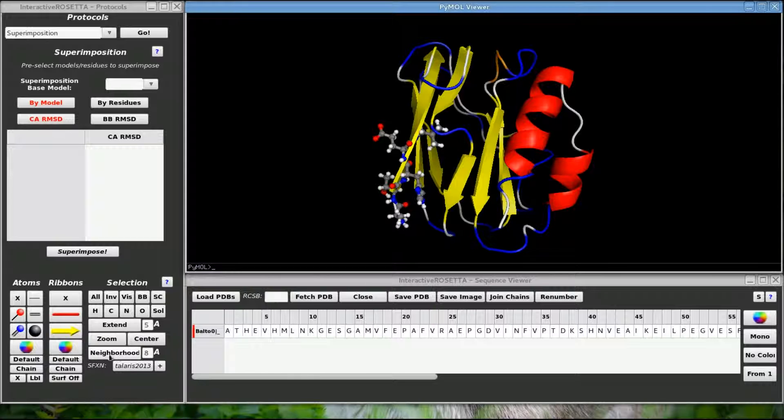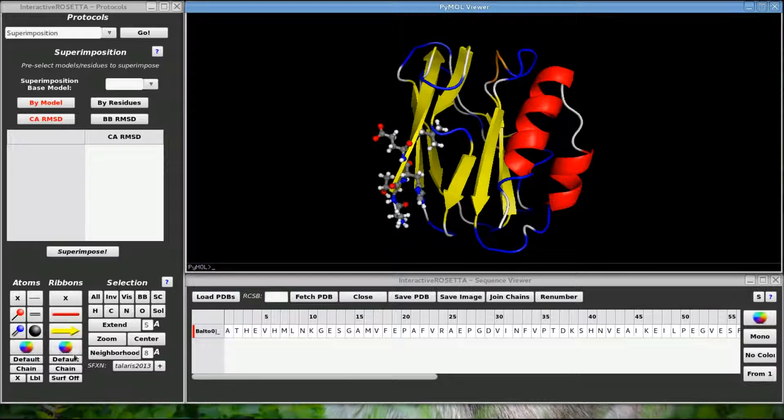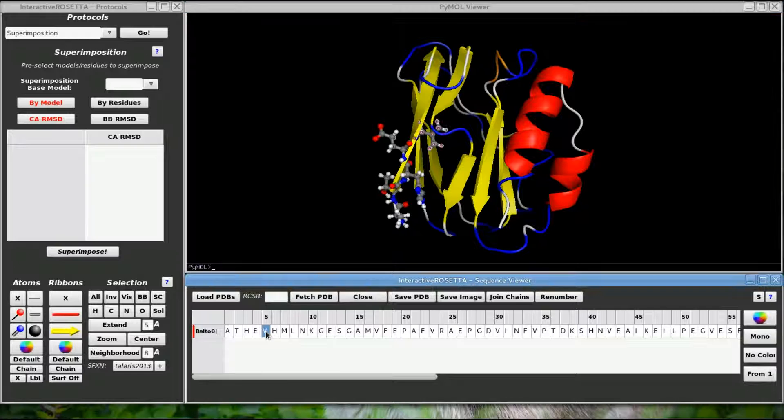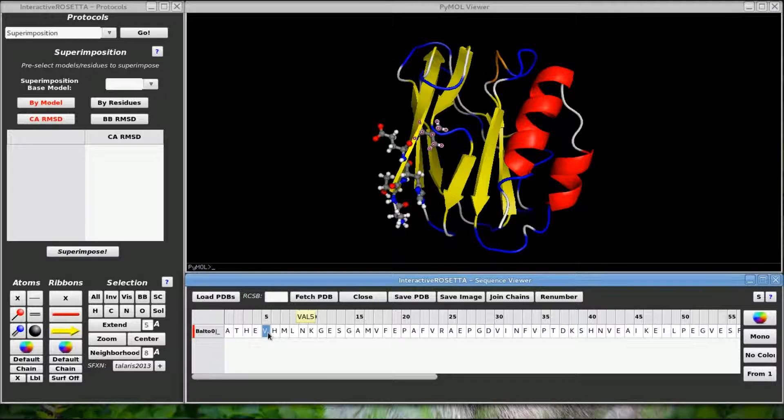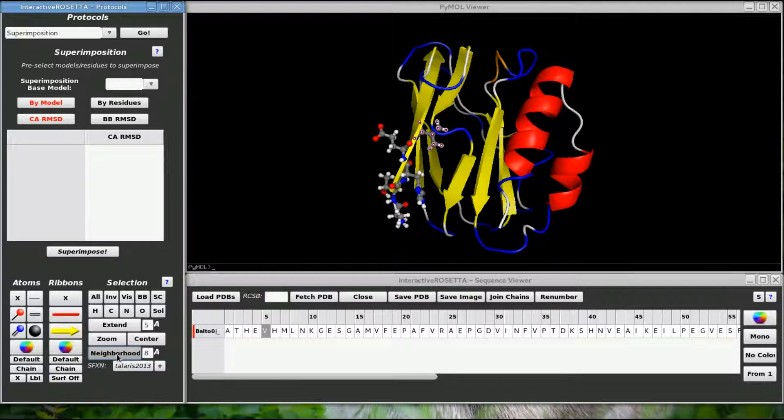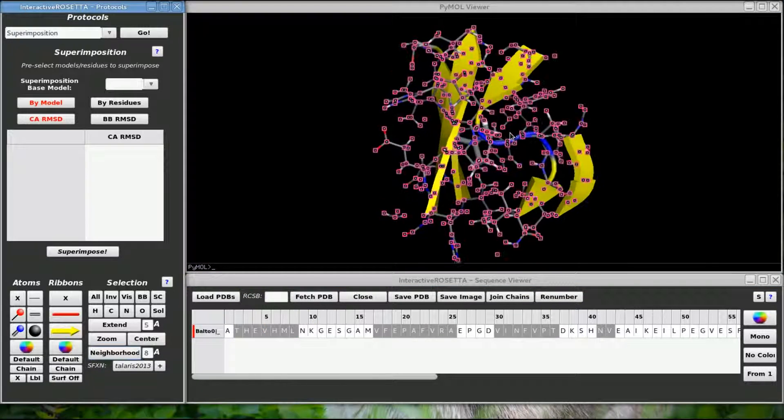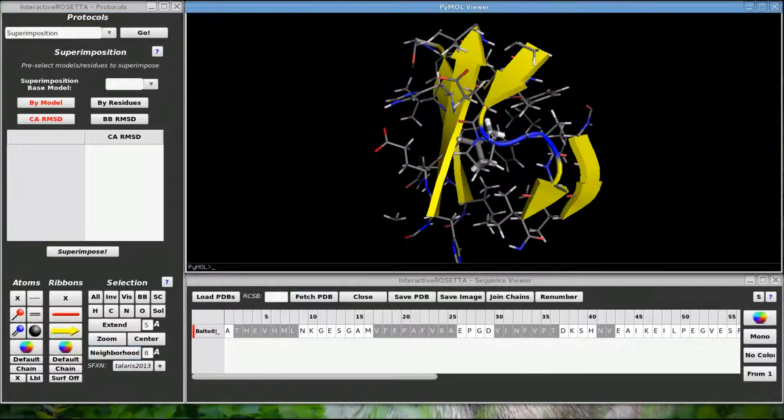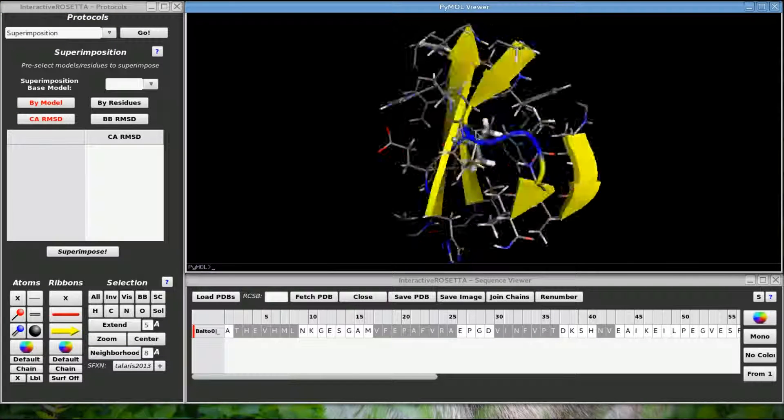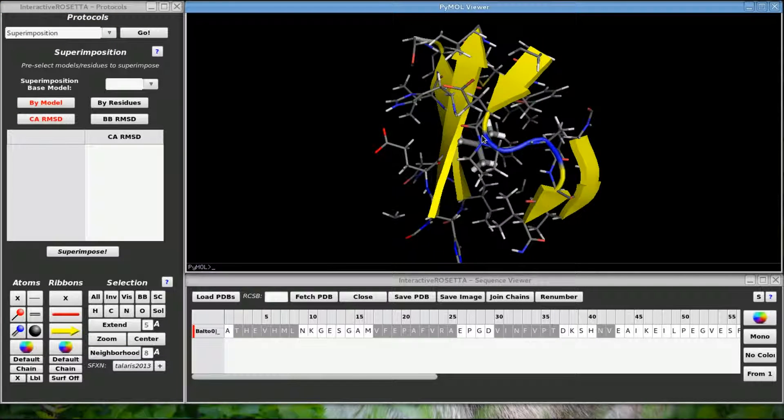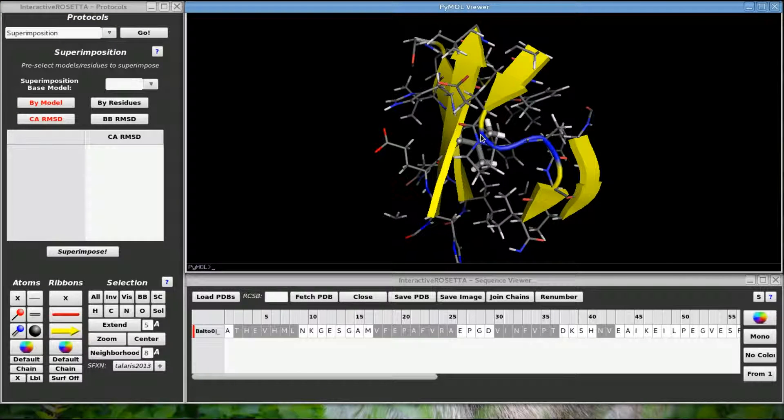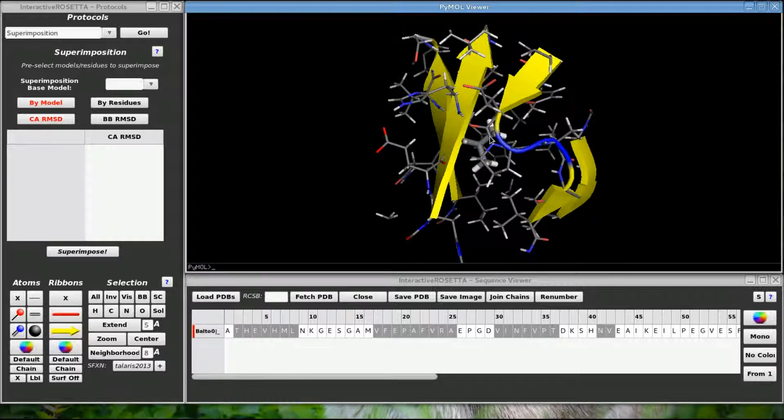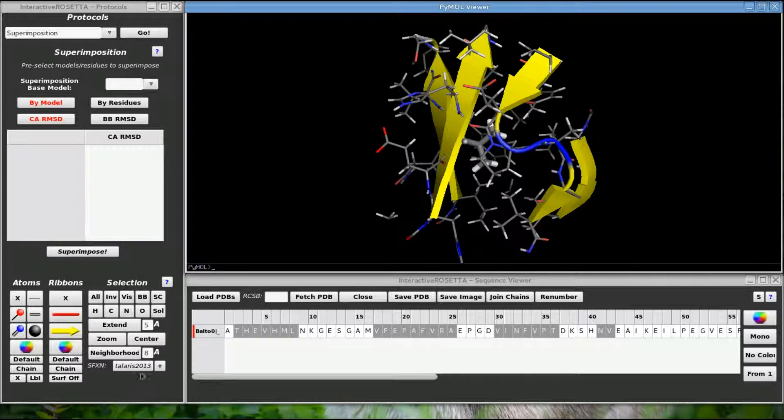This neighborhood button is useful for viewing everything within the region of a desired selection. Let's say I had a special interest in this residue right here. If I click the neighborhood button, then it will zoom in on this residue, beef up this residue and display everything within the radius cutoff in thin sticks. So I can easily see the residue of interest and how it interacts with other residues in its neighborhood.